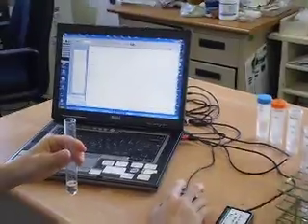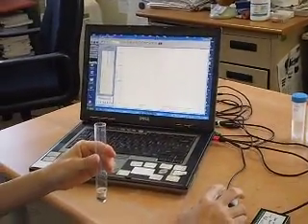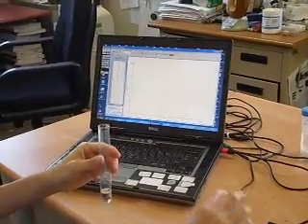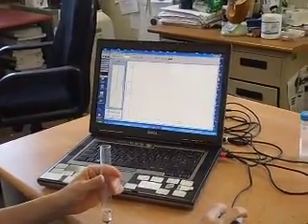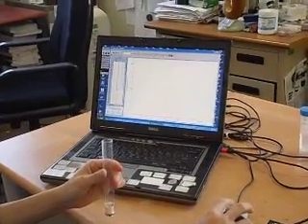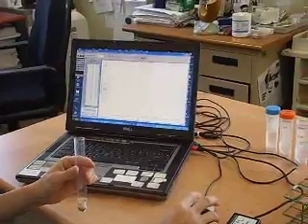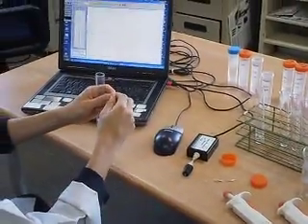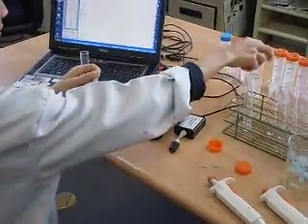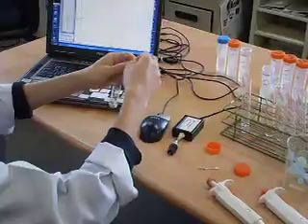So pressure is here. This is atmospheric pressure before I add the magnesium strip. What I'm going to do now is wait until about 50 seconds. Then I'm going to add in my magnesium strip. I'll get ready. Throw it in.